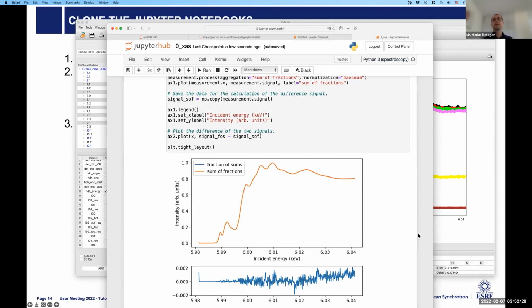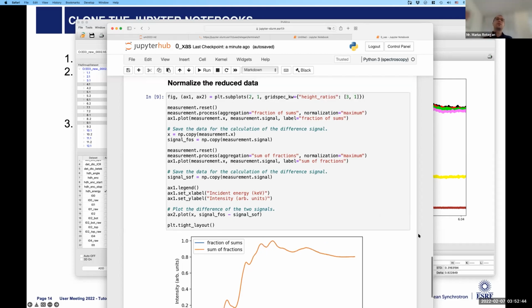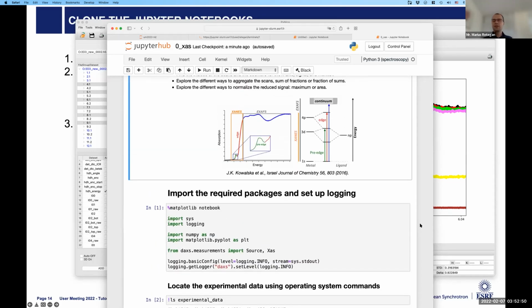So now I see that you save it like you do, but now we are running, I don't know, 100 scans in one trip. So we'll have 100 spectra. So how would you do when you measure 100 different spectra? You write 100 notebooks, or what is the idea? No. So the way you can think of it, you can run multiple in the notebook. You're not limited by how many data analysis you do.